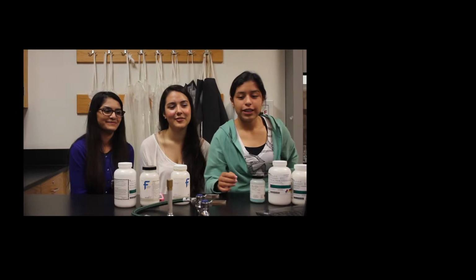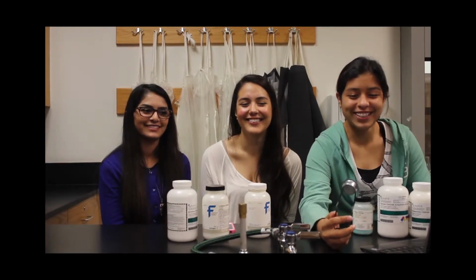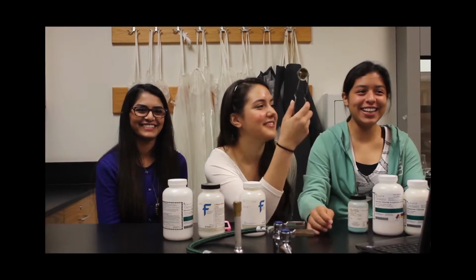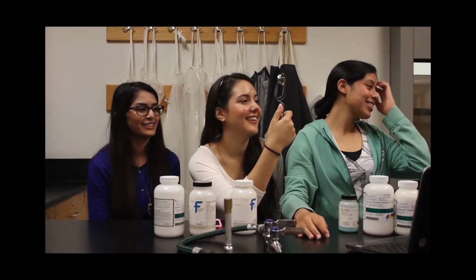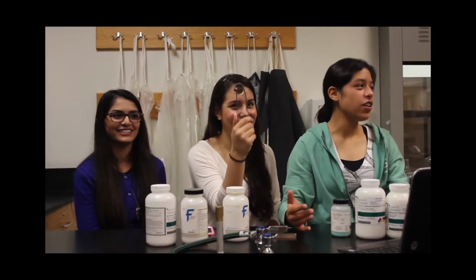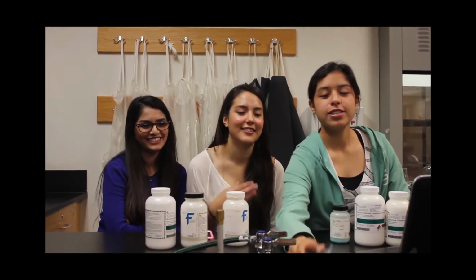What we'll be doing is we'll light up the Bunsen burner and with this. What is this called? I forgot. We can just cut this off. Can we cut it off? No, we're gonna keep it. It's igniter, isn't it? With the flint to start. Sparker. Mr. Blinter. The flame sparker.